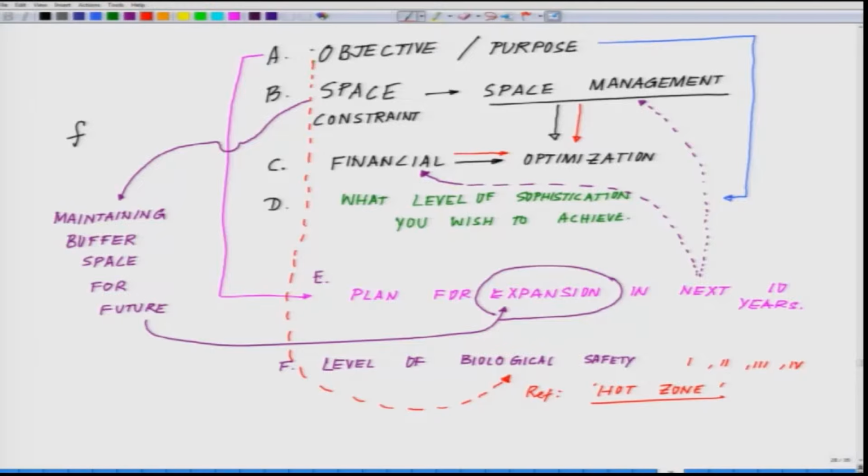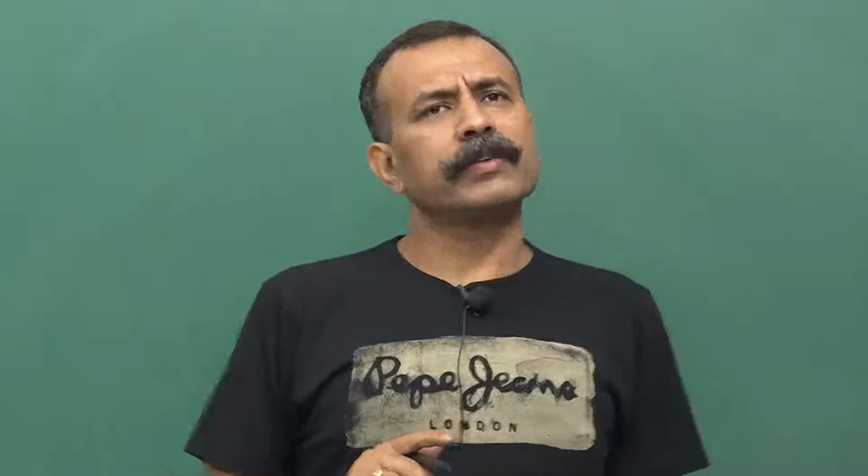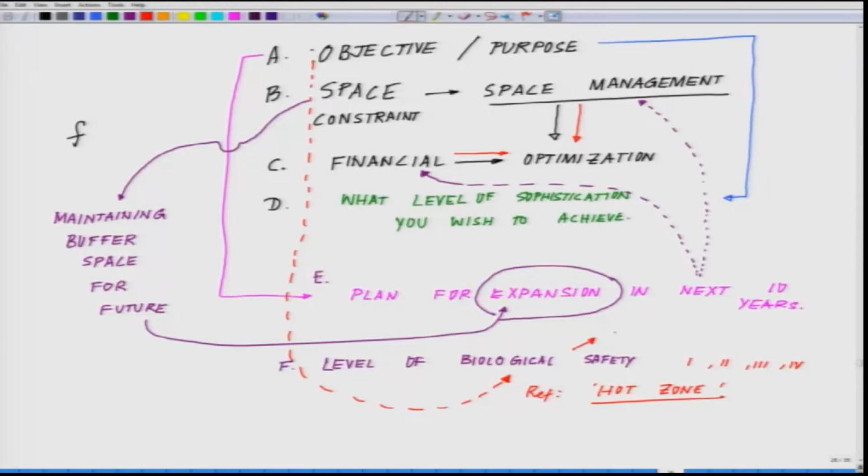This is a very interesting book about deadly viruses escaping out and how that could influence our life in a big way. Okay. So, next is this biosafety level, what you have to be very, very critical about. And in that, of course, I have already mentioned, you have to be very clear, are you working with DNA, are you working with other forms of nucleic acids, and so on and so forth.